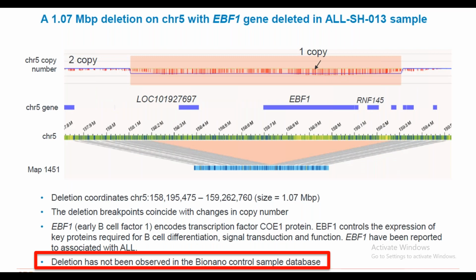Another example from the same sample, sample 13, is showing a deletion. Again, blue is the map made by Sapphire, and green is the reference sequence. Here we can see a deletion of a ring finger gene, and also this other gene, EBF1, which is known to be involved in differentiation of hematopoietic cells, so could conceivably be involved in tumor development. And up at the top, we see a computed algorithm of copy number variation, which again agrees with the map made that there is less, and there's deletion of this gene.